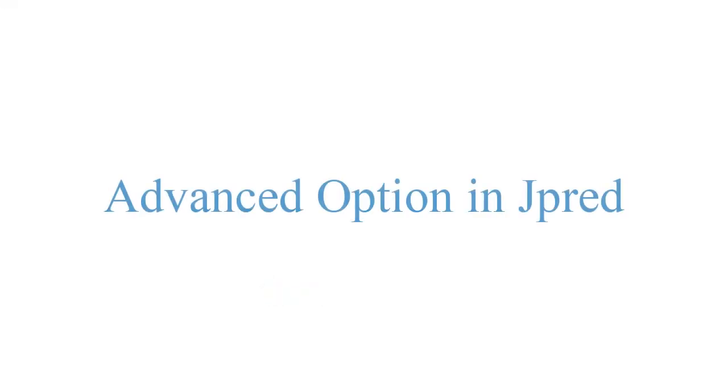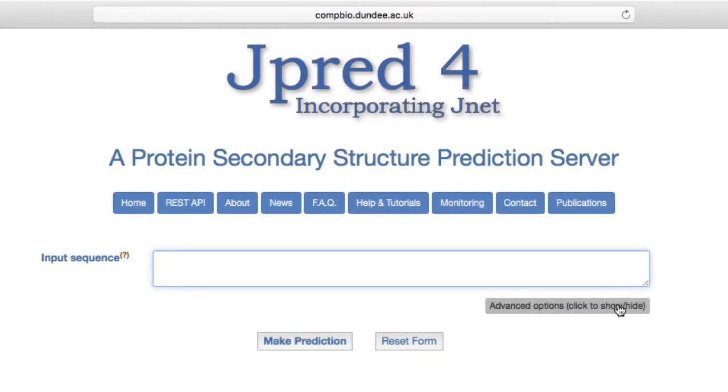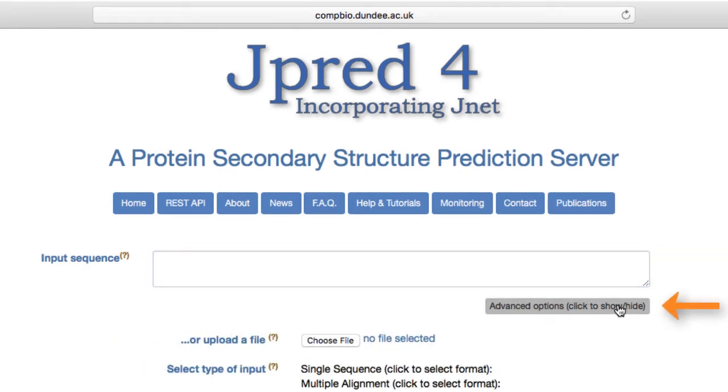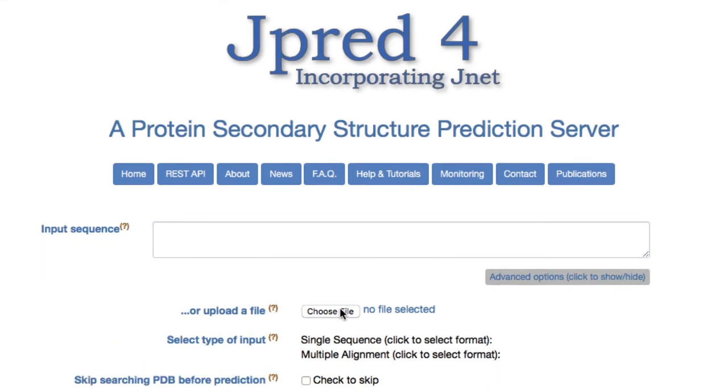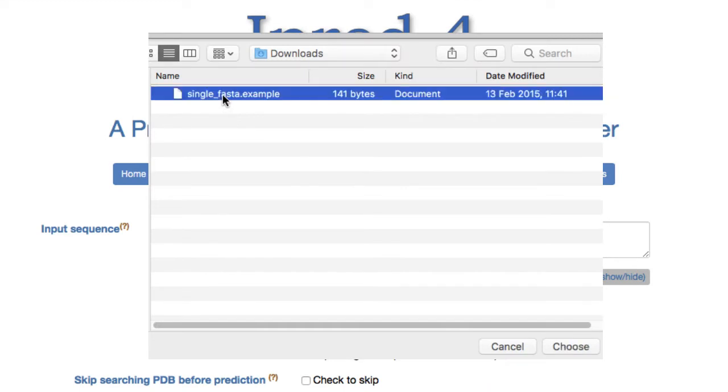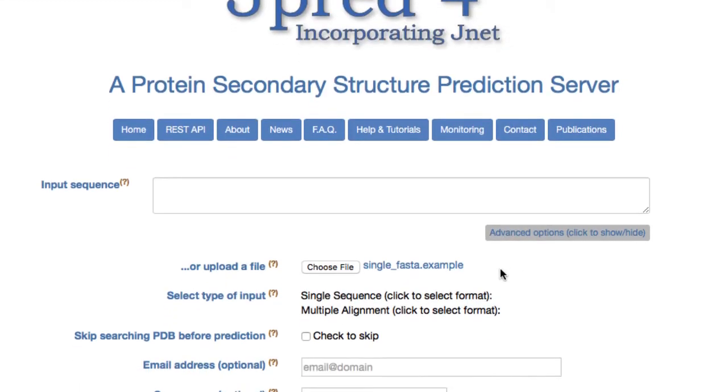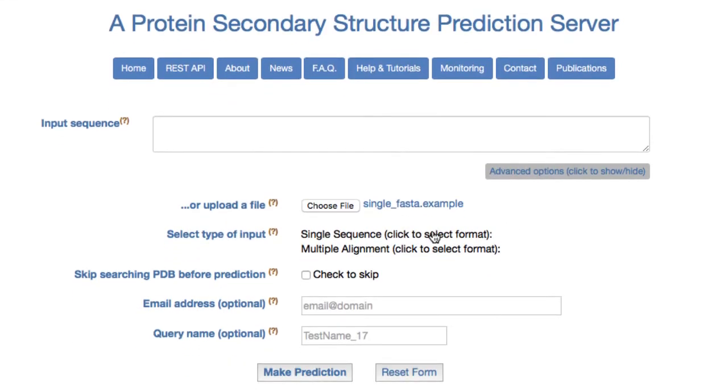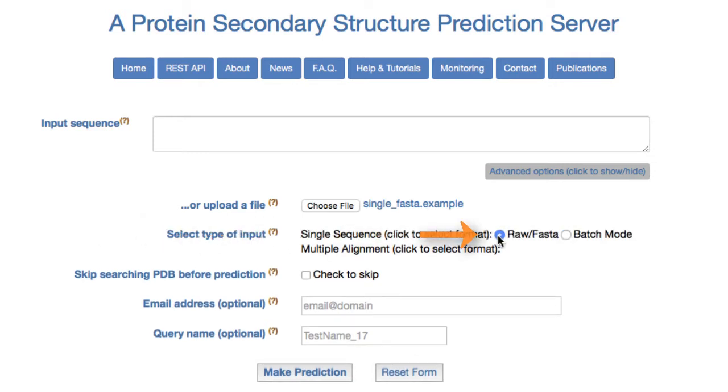There is an Advanced Option mode for submitting JPRED jobs. This can be accessed by clicking the Advanced Option button. Files such as RAW and FASTA files can be uploaded using the Browse button. In the Select Type of Input section, select Single Sequence, then click the file type. Checking this box will skip the PDB search.